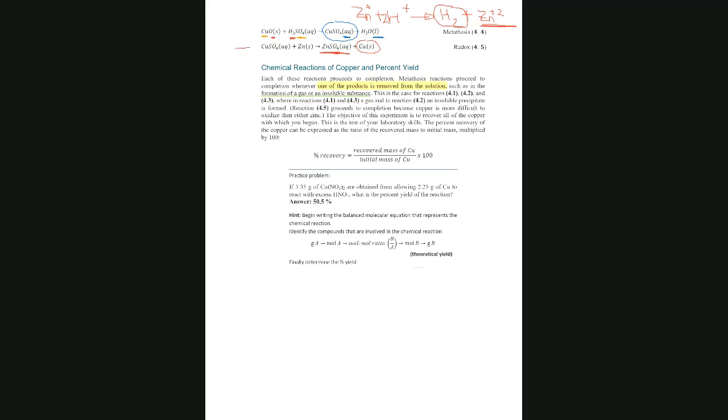The solid, we only want the copper. So that is a side reaction, and we are going to observe bubbles of hydrogen gas. And we heat the beaker until all the zinc is consumed and no more bubbles are observed. If you read the procedure, this is what it says.